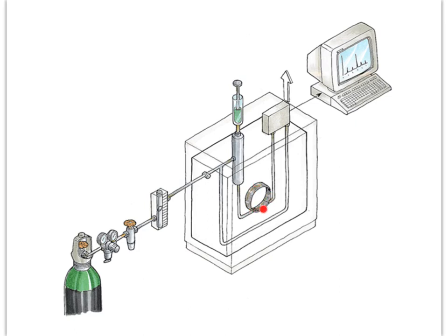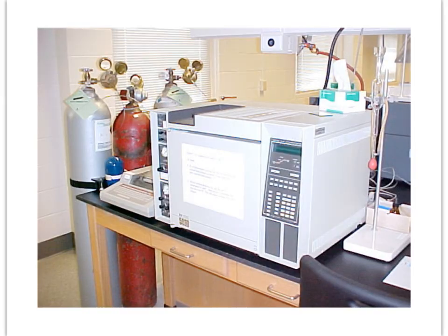And it is during the course of passing through the column that the combination of the vapor pressure of the materials, right? A higher vapor pressure, that is correlates with lower boiling point, means it will spend more time in the gas phase, right? And so it will travel faster. So it's a combination of the vapor pressure of the solute and the nonpolar coating on the inside of the column, right?